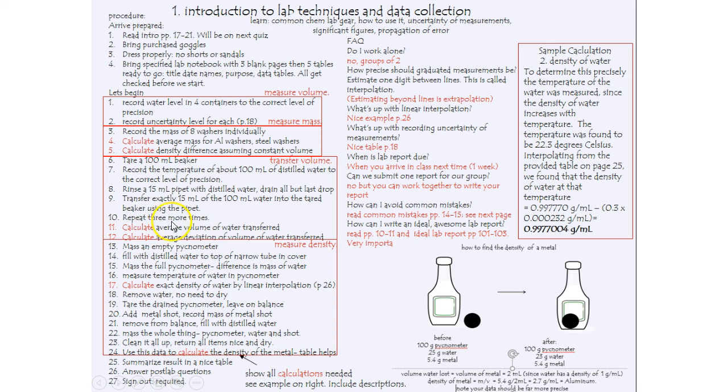Repeat this 3 more times, and then we'll calculate the average volume of water transferred. We'll calculate the average deviation of water that was transferred. Take a look at your laboratory notebook. There's a section in that on deviation from the average.